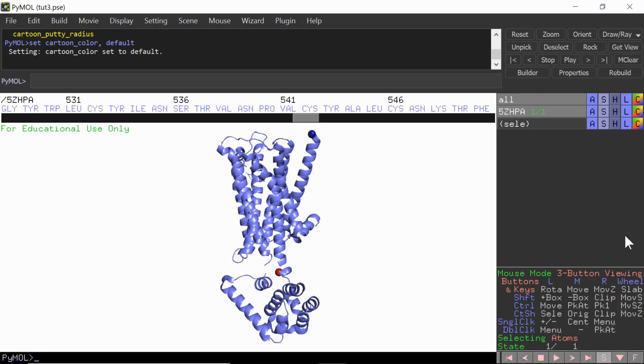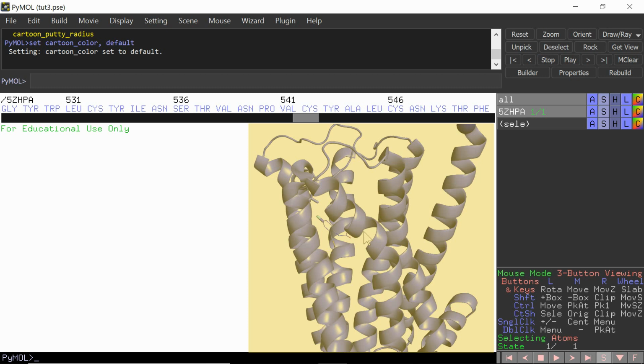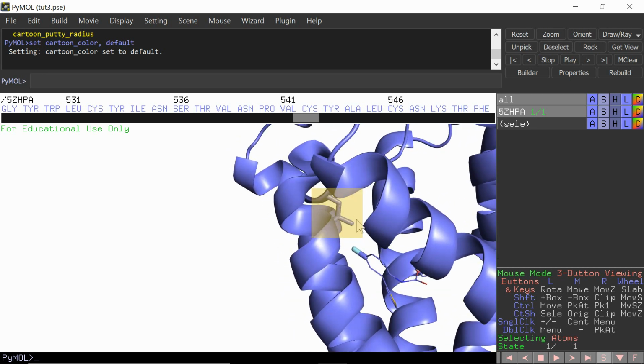Now that we've gone over the process of choosing a purpose for your project, as well as designing a color palette, let's apply both. First, the purpose. Going back to the literature, we know a couple things about the protein that we want to show. Not only do we need contrast between the extracellular and intracellular portions of the protein, but we'll also need some contrast between the ligand and the receptor itself so it stands out. And lastly, we're going to want a slight amount of darkness for this residue here, leucine 225, in order for it to stand out from the receptor. If it's the same color as the receptor, sometimes the sticks representing that key residue can get lost.